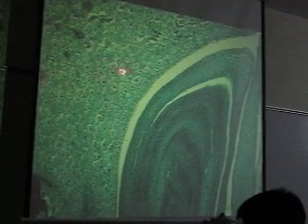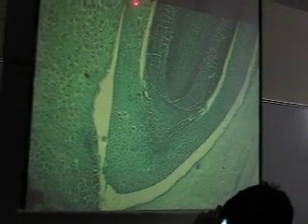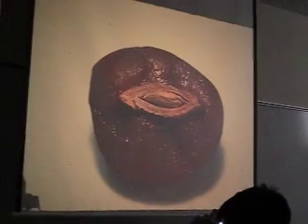Okay. So take a look at the corn end. This is all endosperm. There's the tip of the scutellum. This is all scutellum here. Bunch of leaves inside a coleoptile. Mesocotyl, where everything meets in the middle. And then coleorhiza and radicle. I think there's a root cap starting already. It looks like a root cap right here on the tip of the radicle, all the way back in the embryo stage.